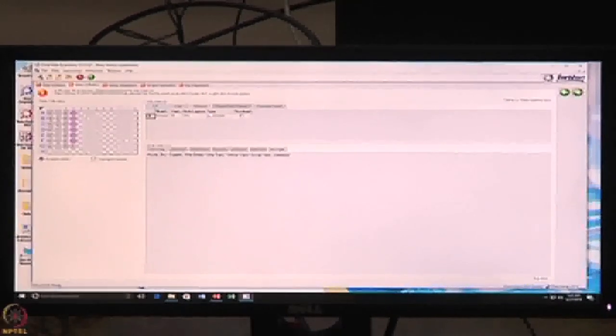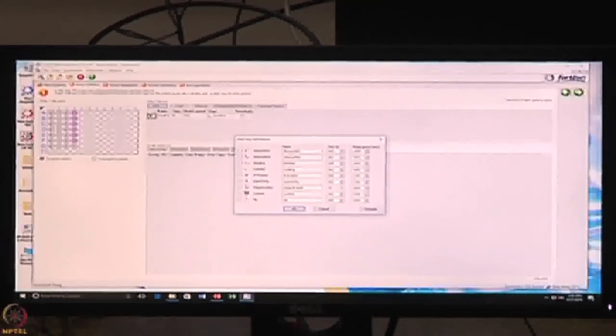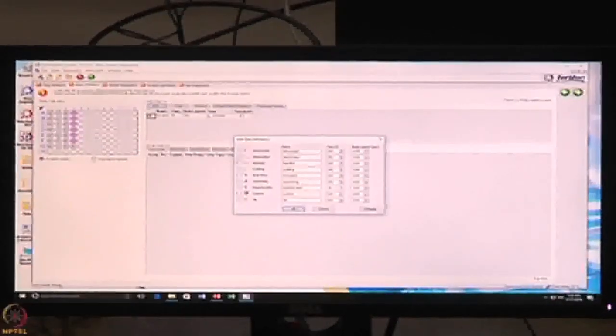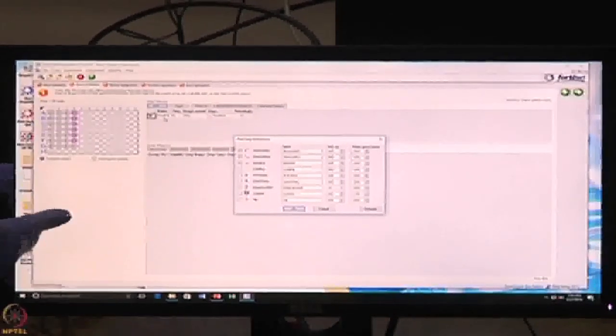Here there is a section called add. When you click on this, we are doing a baseline, a loading, an association, and we are also going to do dissociation. So those we have to add. I click association, dissociation, and baseline. By default, one baseline is already there, but you need one more baseline, because we have two buffer columns. That's why I'm adding one more baseline.